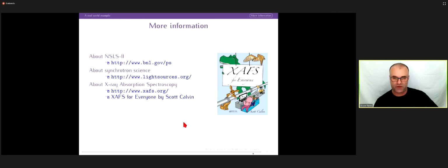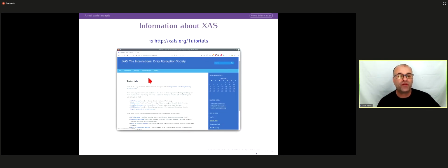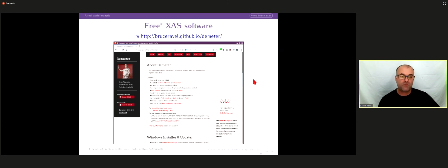It's really excellent. If you squint here in this tiny text, you can see the new URL. I really need to update this apparently. So if you go to xrayabsorption.org, there's a tutorials page that provides links to lots of information, including all the talks that I give on this topic and lots of other really smart people also. And finally, if you are planning to measure things, there is freely available software, free in every sense. It's free to use, it's free to look at the source code, and it's free to redistribute. So there are resources out there for you to use when it comes time to do XAFS.